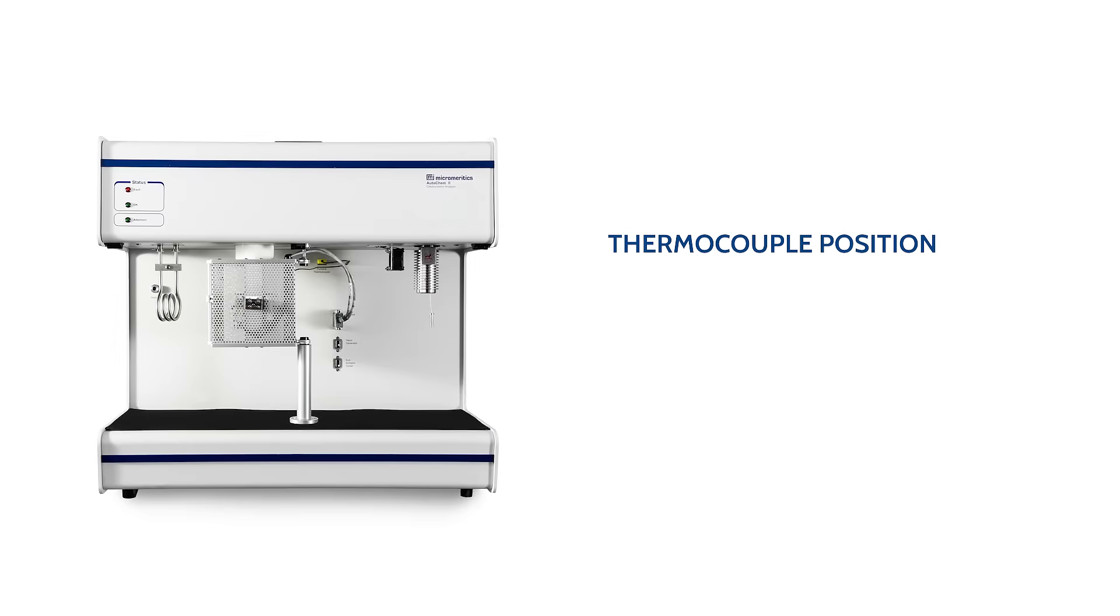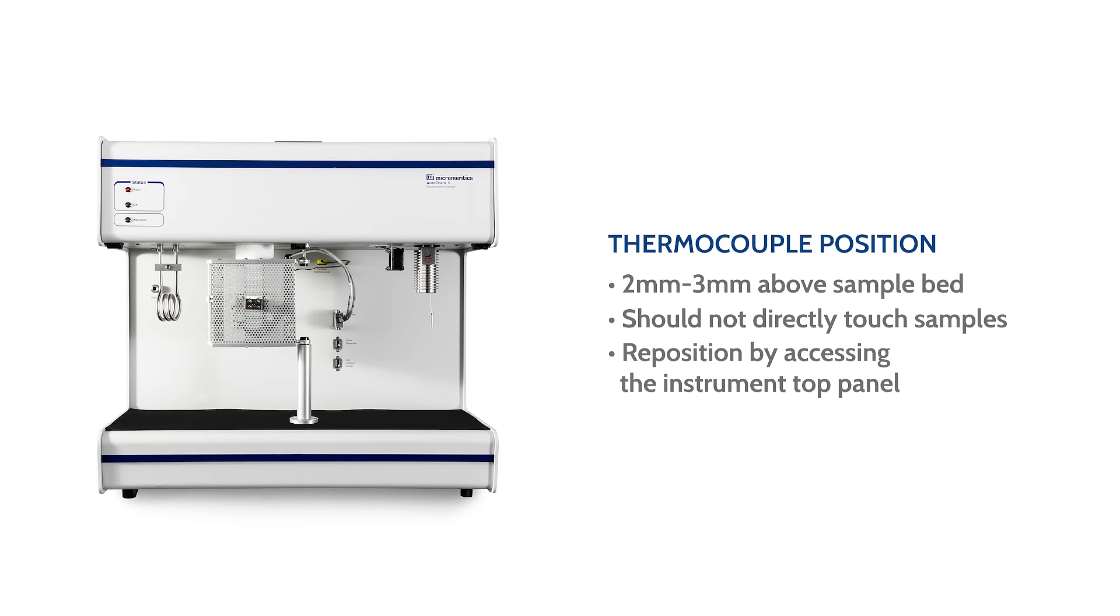To ensure an accurate result, the thermocouple should be placed right above the sample bed without touching the sample, especially for temperature-programmed analyses. To set the thermocouple, we need to access the analysis valve heat zone, also called the sample valve heat zone, which is located on the top panel of the instrument.